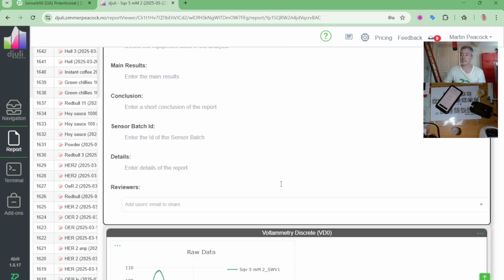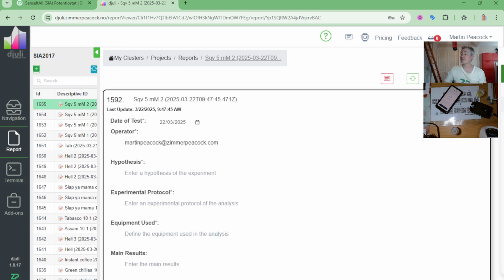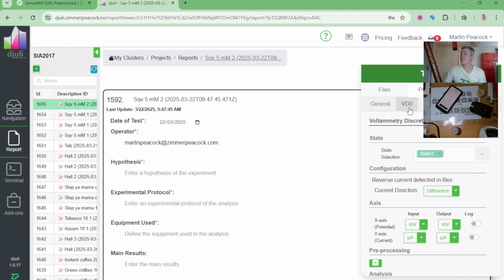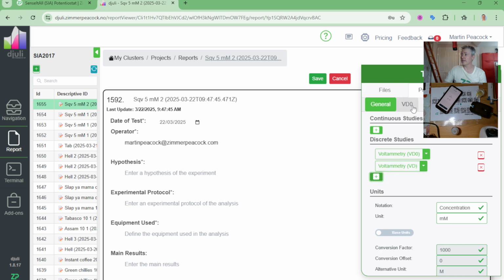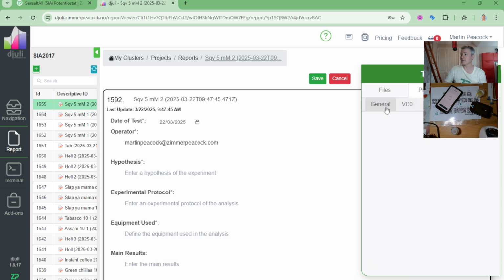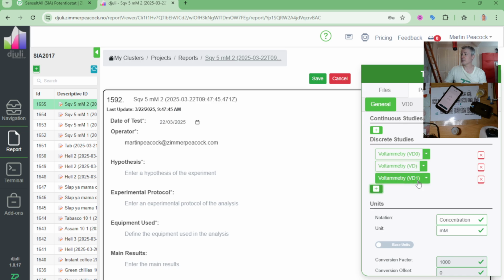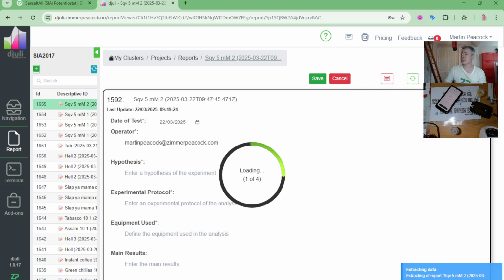There's the forward scan, there's the forward, and there is the reverse. So I'll show you what those look like now. If I just go into tools, and I go here, let me just have a quick look. And I'll go general. I'll just add VD1, or just VD, and I can see that that's the forward. And then if I go here and go VD1 here, I'll make sure that I choose the reverse here. So let's just have a quick look at what that looks like.